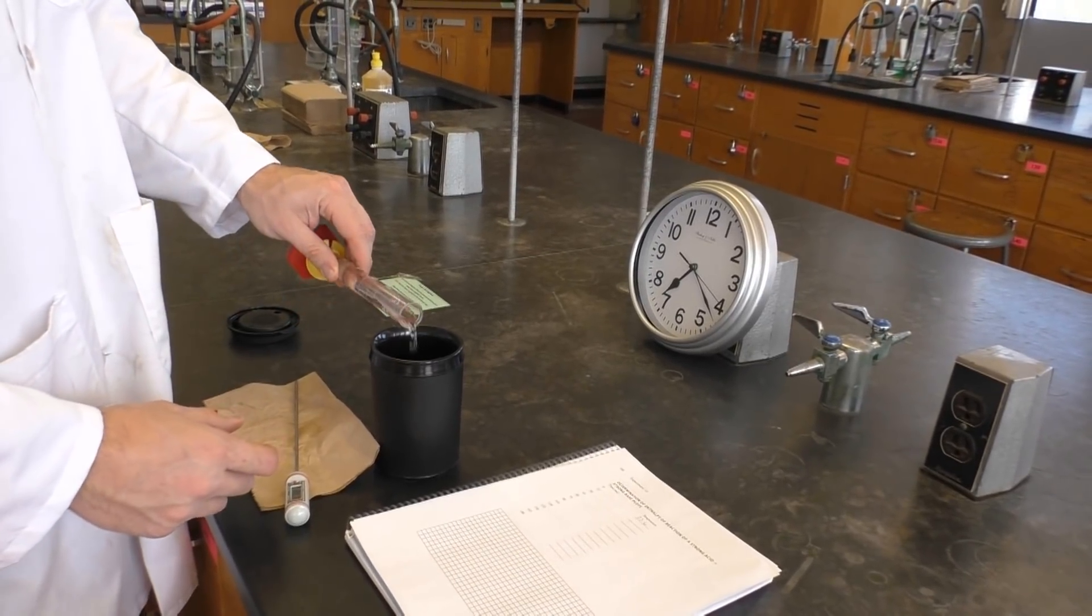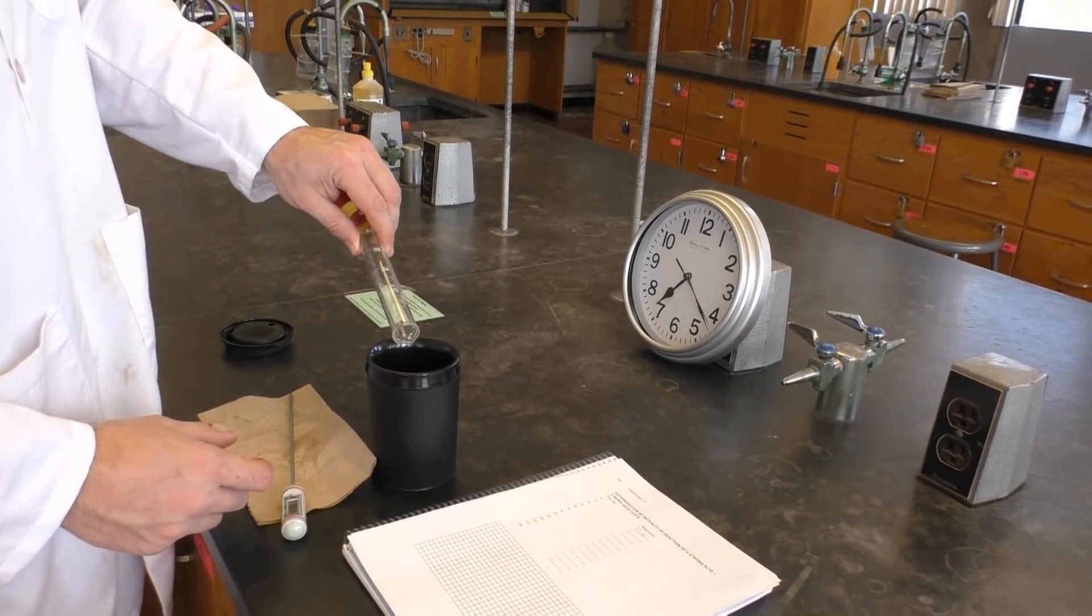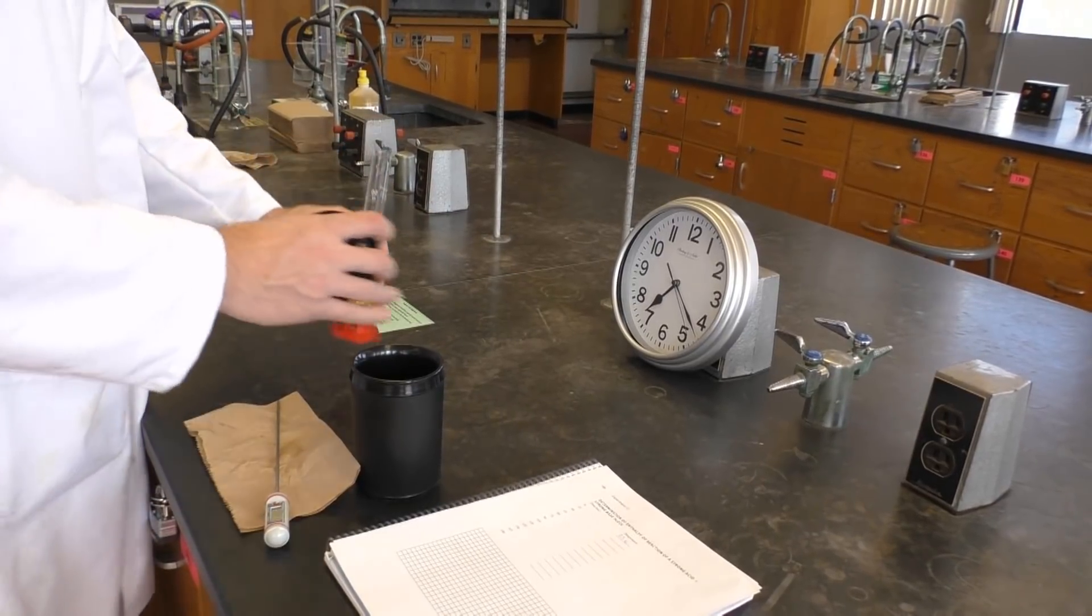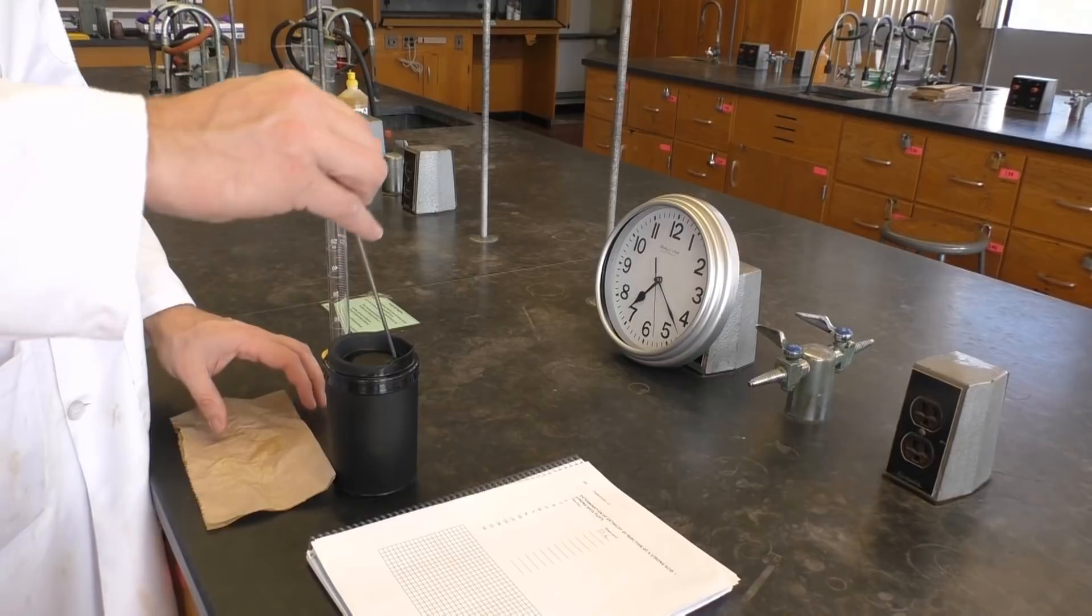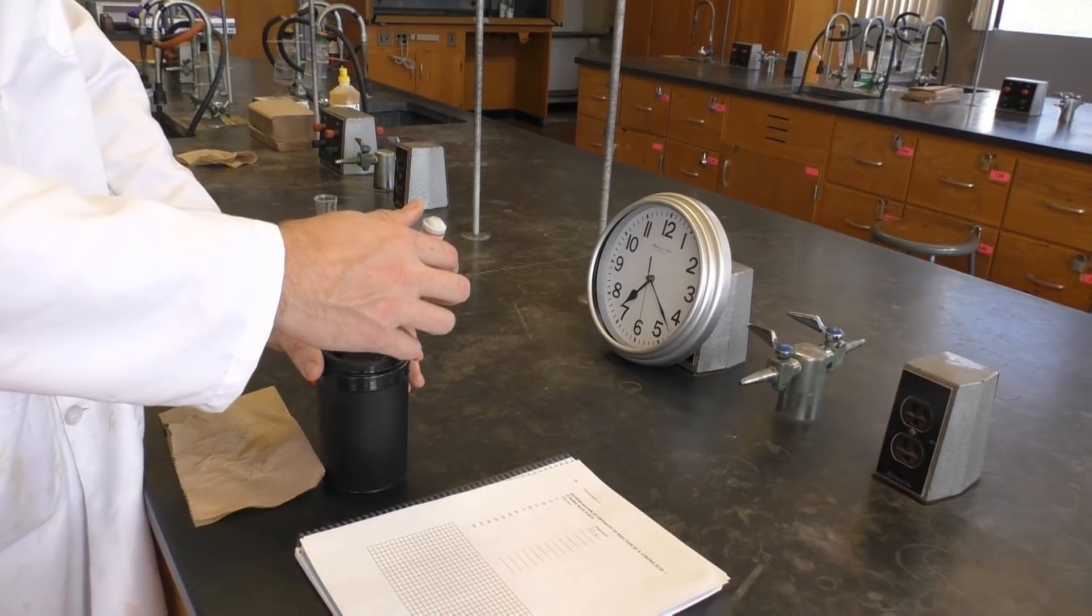Now, just like before, quickly add your acid all at once to your calorimeter. Cover, swirl, and record the temperature every 15 seconds for 3 minutes.